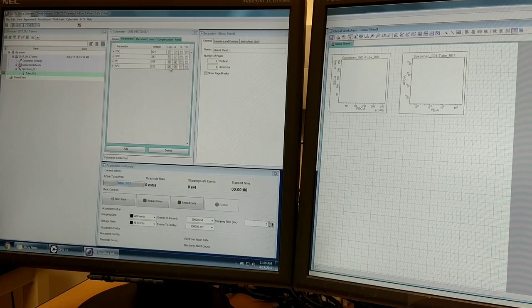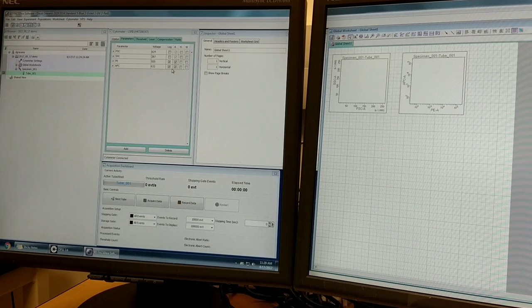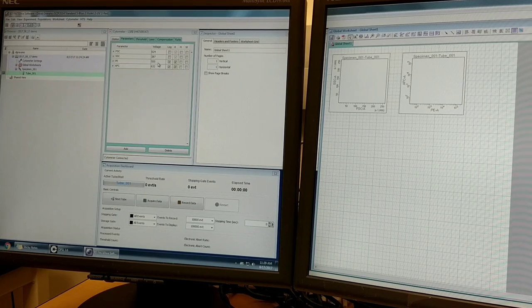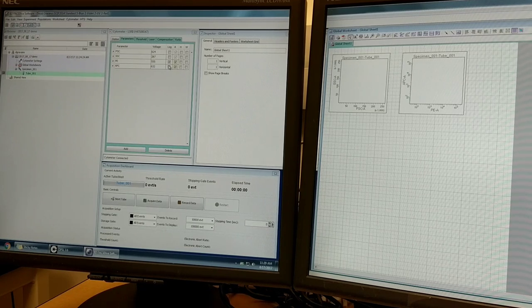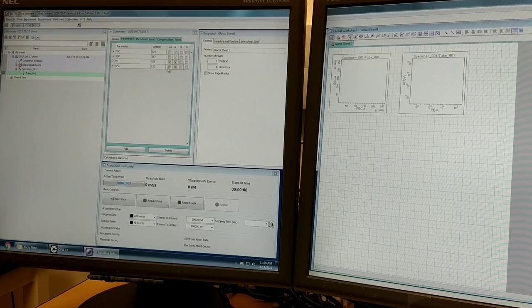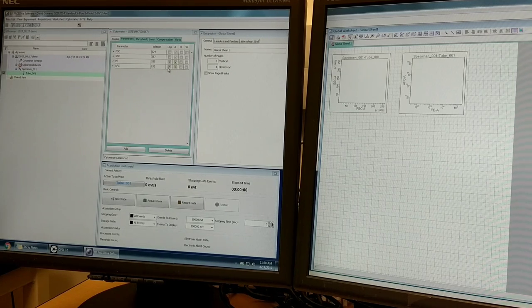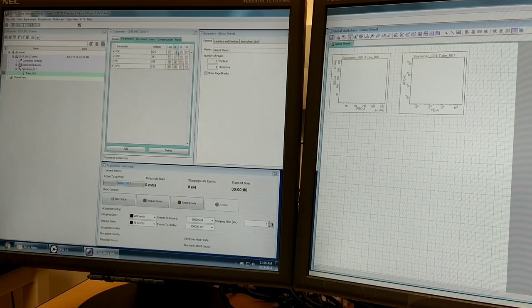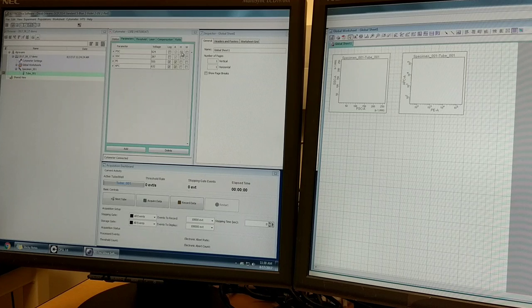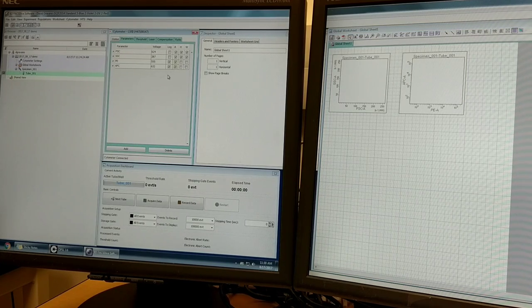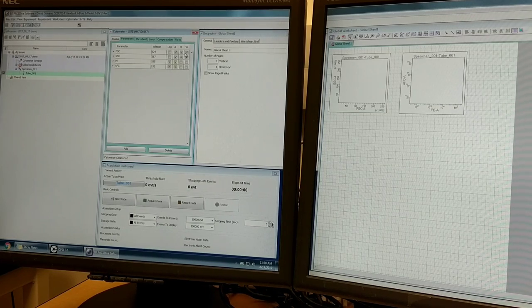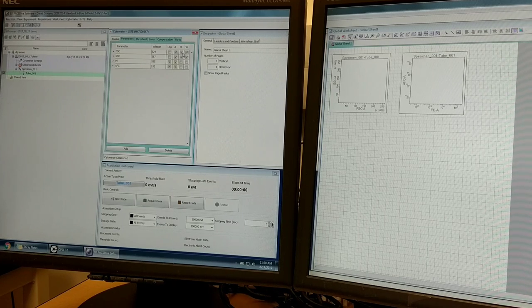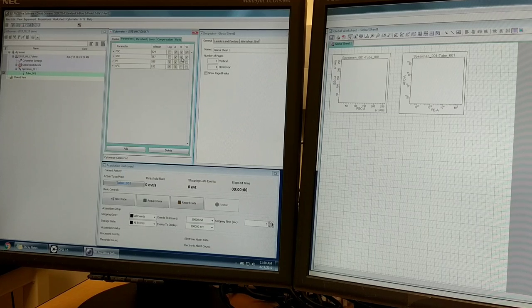For the fluorescent parameters, that's almost always viewed in log scale. The most common exception is when people are looking at DNA content and looking for a small change in DNA content to discriminate cells in the G0 phase versus the SG2M phase. The area is always collected, and the height and width I'm going to select for both forward and side scatter. This is a method to do doublet discrimination after you acquire, if you have these boxes checked.